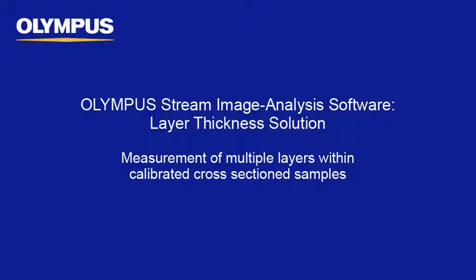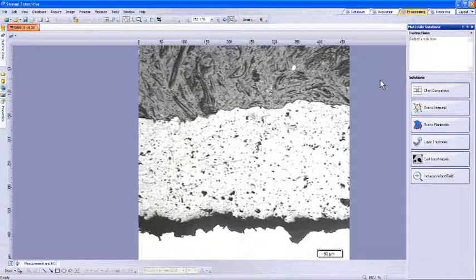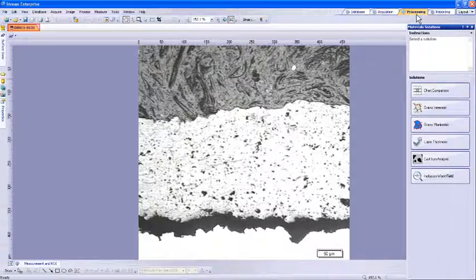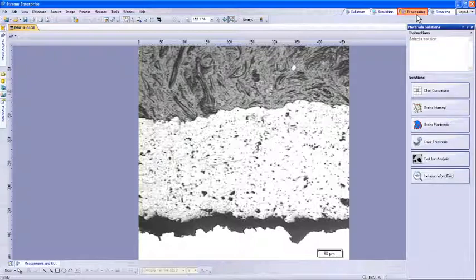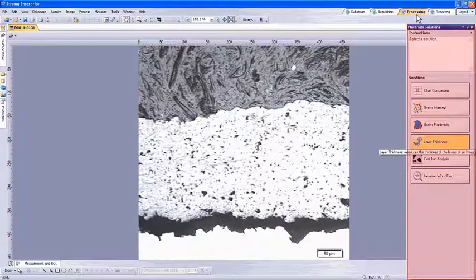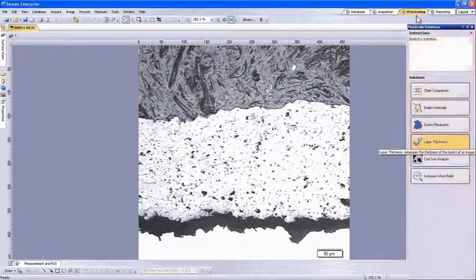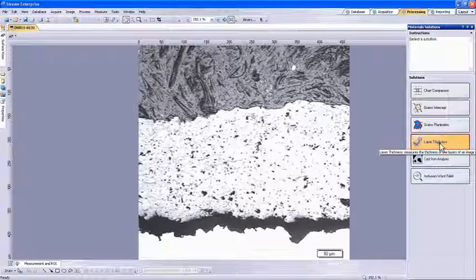The layer thickness solution is an add-in module for Stream Essentials and above. To begin, we need to have a captured image of a cross-section sample with open layers in the Olympus Stream software. For measurement and evaluation of the image, we will want to be within the processing tab. Within the material solutions tool window, we will choose layer thickness to start that specific solution.